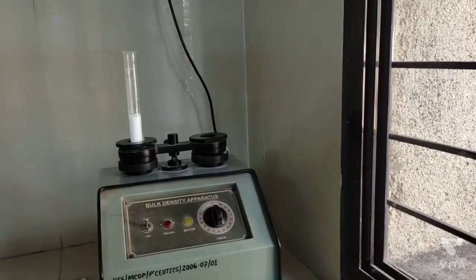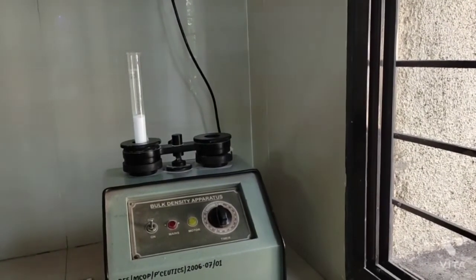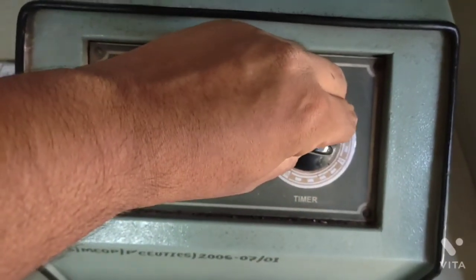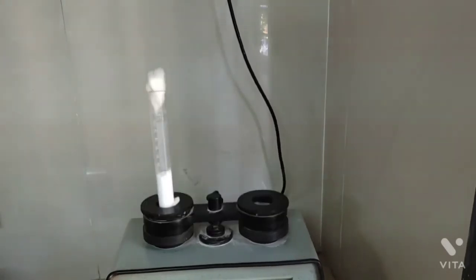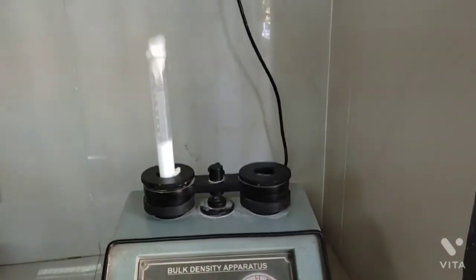Place that measuring cylinder on bulk density apparatus and start tapping it. After tapping the powder, mark the volume which means tap volume.